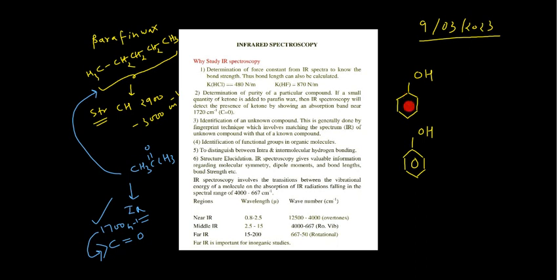They think this cyclohexanol and this phenol are the same thing.